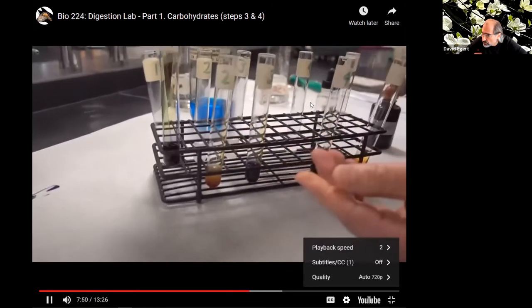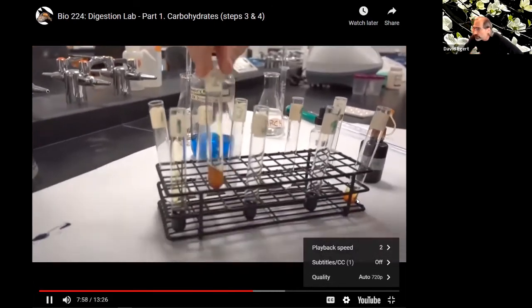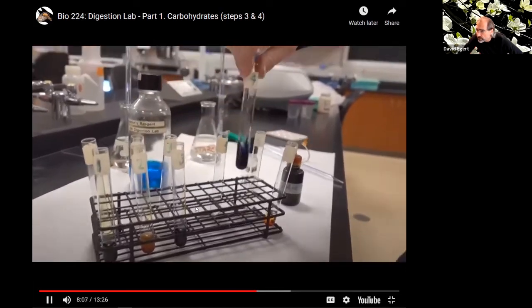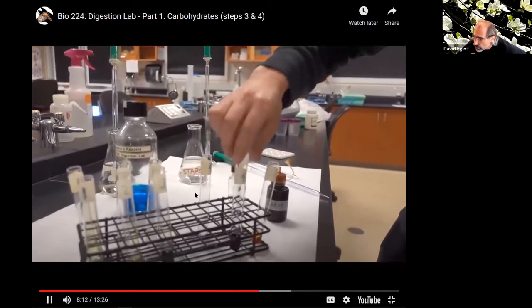Tube 1 is dark purple black, presence of starch. Tube 2 is amber, that's just the color of the iodine, so this would be no starch, looks like. Tube 3, we also have a very strong reaction here. And this is encouraging. Our pure starch is showing positive, and pure maltose is not.